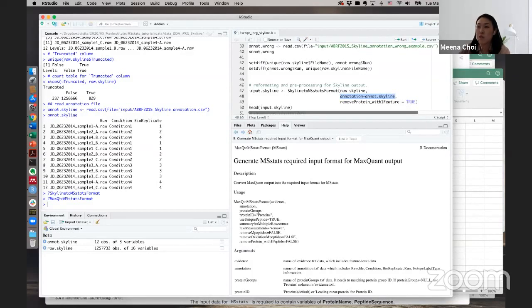A big part of the error is annotating peptide as feature and misarrangement of peptide annotation. Yes, it can happen. But for MSstats, we just assume that everything is correctly annotated. We are not checking the annotation. One kind of solution is what Olga briefly mentioned, the feature selection. If peptides are annotated differently, maybe they behave differently. The feature selection algorithm can handle some of this, but it also has a risky part, because we are not sure whether this is because of misassignment or because this specific peptide actually behaves differently, which may be quite interesting for a biological study. So that is one of the options.